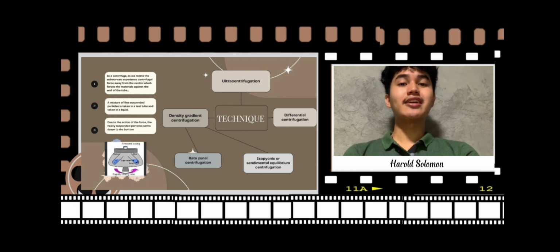The next technique is differential centrifugation. It is a common procedure in microbiology and cytology, useful to separate certain organelles for further analysis of specific parts of cells.